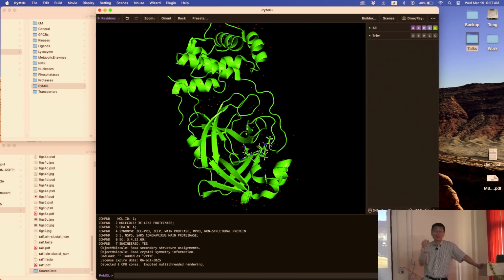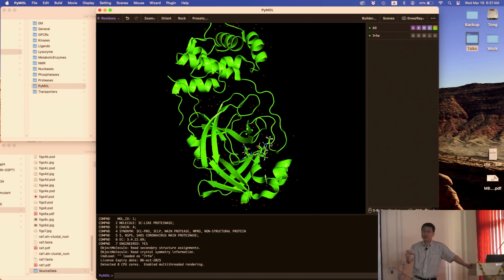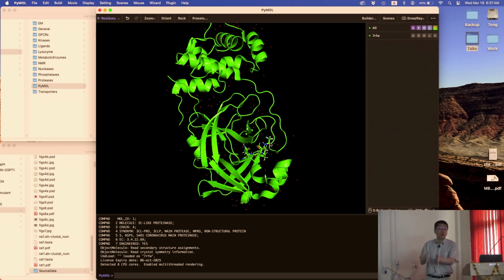Just like Coot, we'll start PyMOL today, and then you go home to exercise PyMOL, and then tomorrow we'll try again. And then I'll figure out something to show the structures I talked about today. That's okay. I think it's more important for you to learn the tools so you can look at the structure yourself. If you don't know the tools, you can't look at the structure yourself. So it's more important for you to learn the tools first, right? Do you all agree with that?